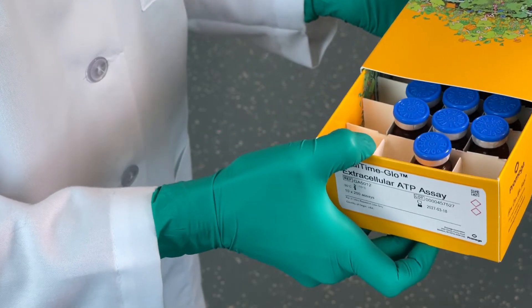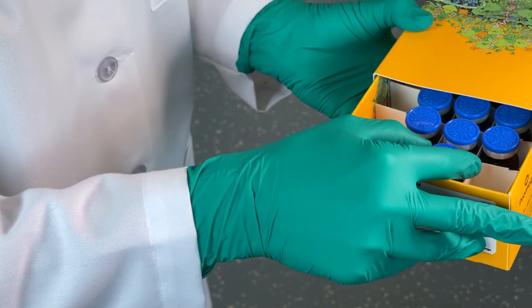Hi, I'm Sarah Mahan, a research scientist at ProMega. I routinely perform multi-day kinetic assays using the Glomax Discover to develop new luminescent live cell reagent assays, like our real-time Glow family of live cell assays. Let me show you how easy it is.